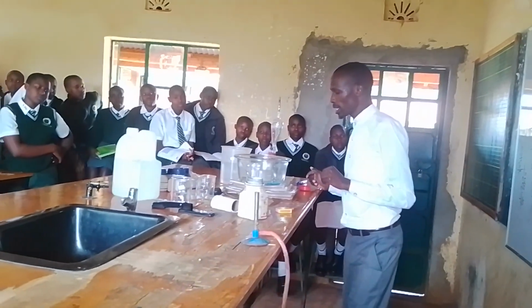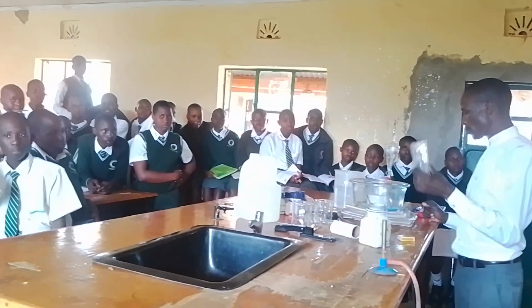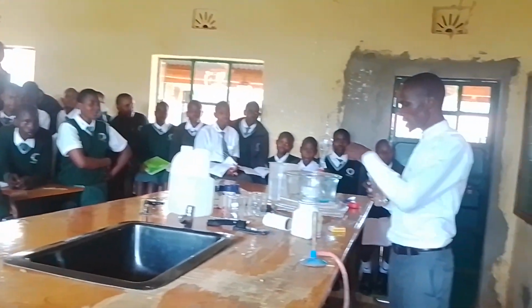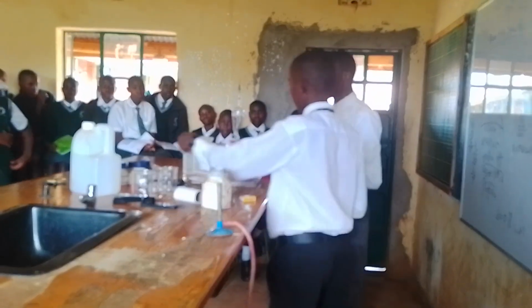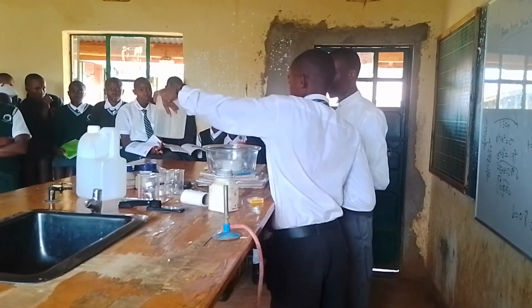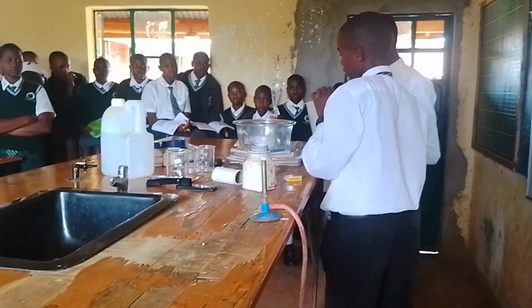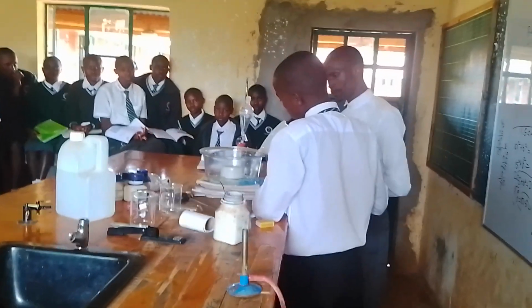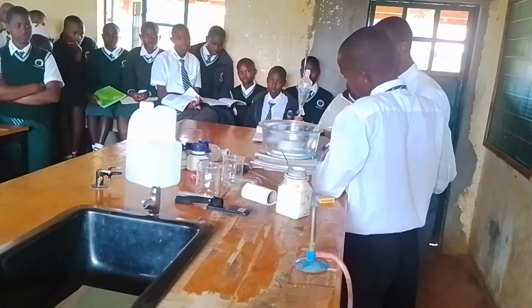So after doing this, I would want one person to come and help me pour water here, and then we will place this and make it ready. So you can just come and place water into the trap, water in this trough here. Yeah, good amount of water.